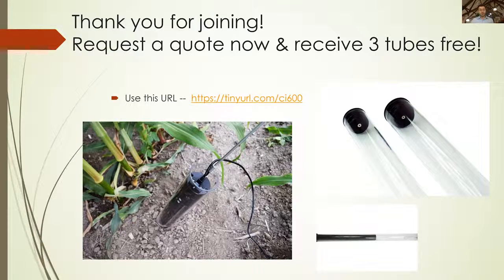We have another question. Do you have to install before planting? I believe it's asking. We do definitely suggest installing before planting. However, we have had researchers installing afterwards. So it's really very much a plant-by-plant dependent situation. If you think your plant would be resilient to having an auger getting too close to it and the tube installed, and it would still grow around within a matter of weeks, that's going to be fine. If that's going to do detrimental harm to the plant structure, I would not suggest doing that. Ironically enough, what I usually find is that grasses are a lot hardier than things like trees or shrubs.